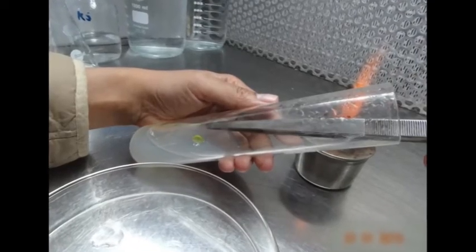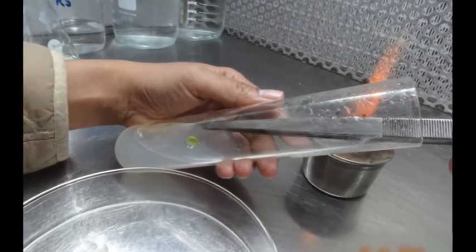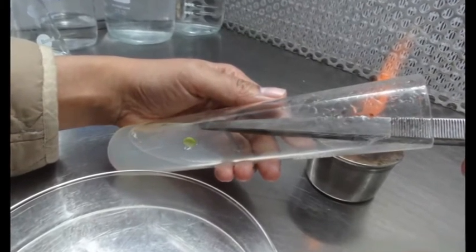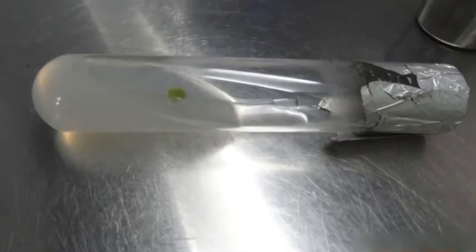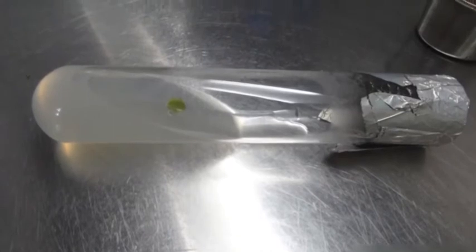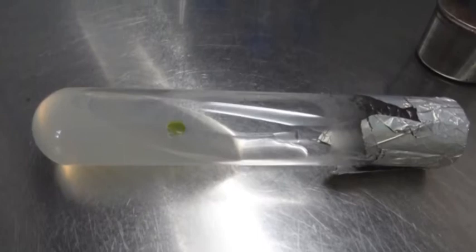Use the forceps to hold the explants and place them on the medium by gently pressing so that the explants make contact with the medium. Replace the cotton plug of the culture tube and mark the tube with the date and details of the experiment.